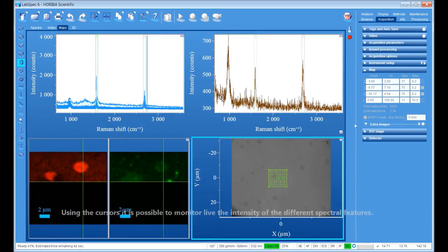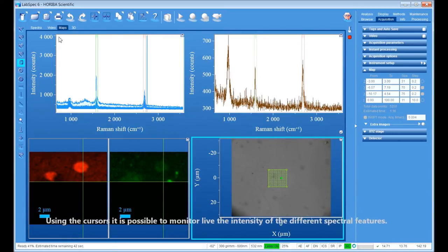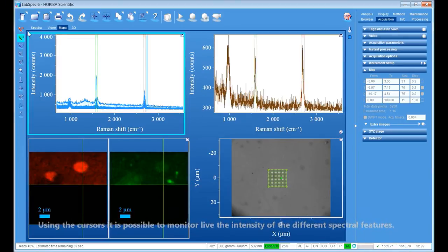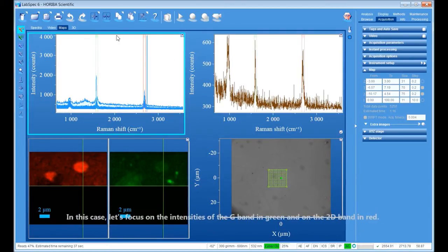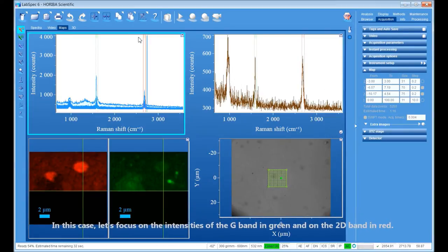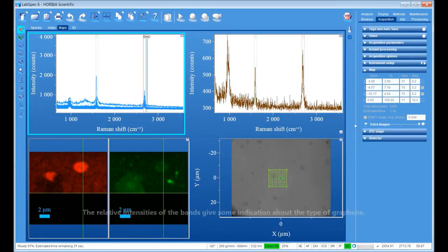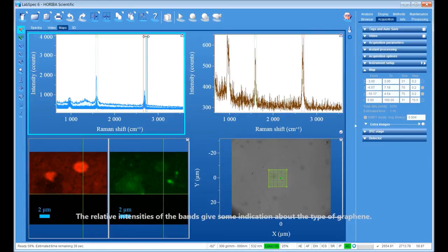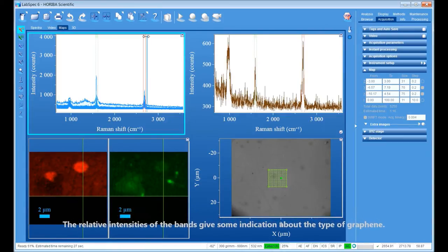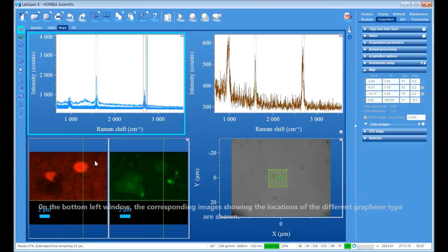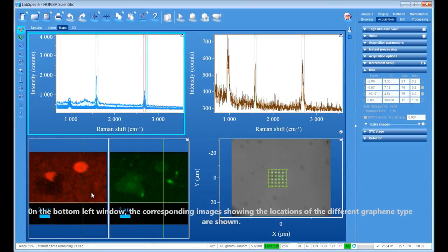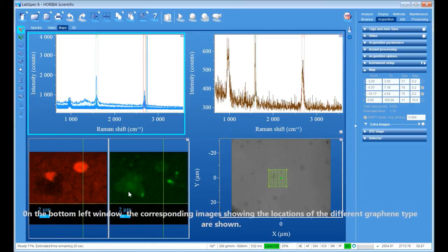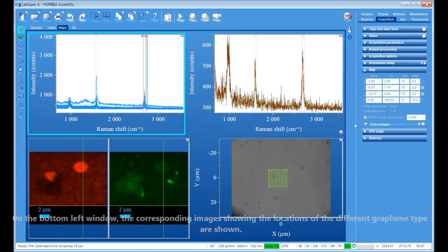Using the cursors, it is possible to monitor live the intensity of the different spectral features. In this case, let's focus on the intensities of the G band in green and the 2D band in red. The relative intensities of the bands give some indication about the type of graphene. On the bottom left window, the corresponding images showing the locations of the different graphene types are shown.